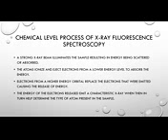Now that you know what X-ray fluorescence spectroscopy is used for, let's talk about the chemical level process of how it works. A strong X-ray beam, also known as an incident beam, illuminates the sample as well as scatters and absorbs some energy. The atoms ionize and eject electrons from a lower energy level to absorb the X-ray energy.